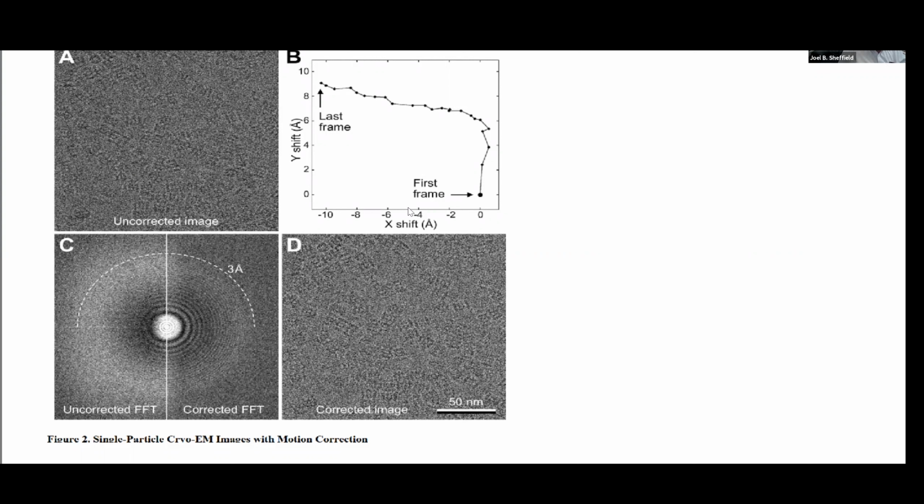And this is a diagram that says, look, if we take a movie of this image, that is, take a set of frames, okay, and then plot the position of these structures with respect to time, then what you find is that, in fact, they move around, okay?